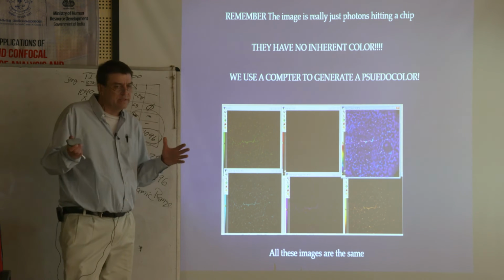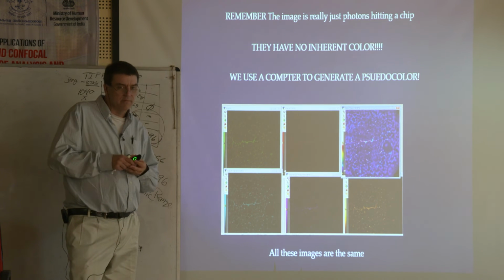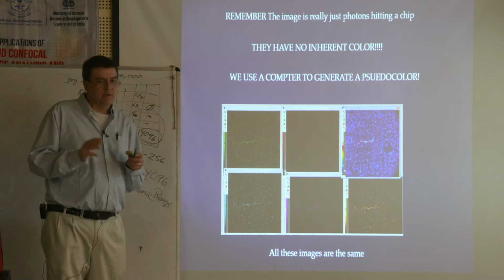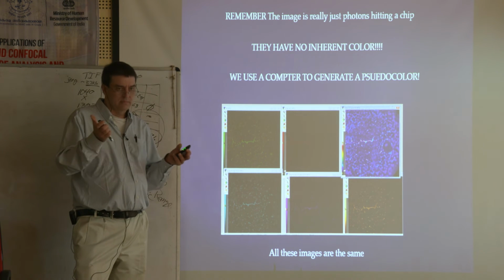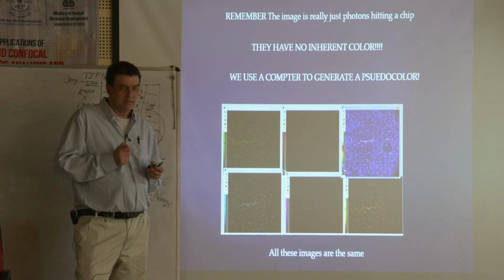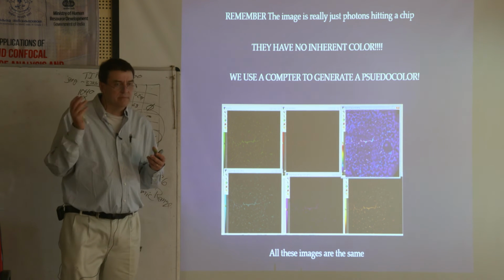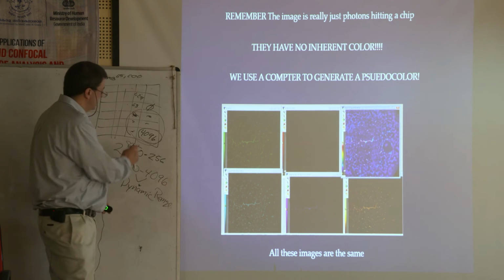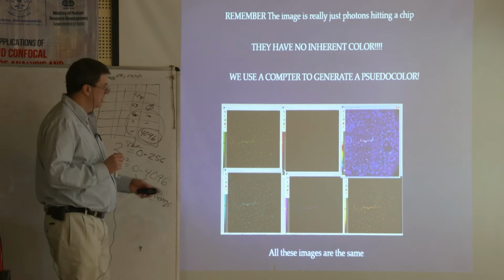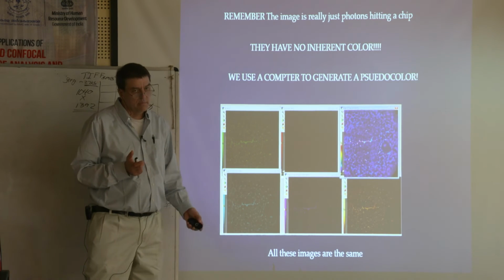Is everybody clear on this concept? Because this is a key concept to the whole idea of how these things work. If you're not clear on it, let me try to explain it a little better. We good? What do you think? Because it's not an easy concept to wrap your head around sometimes. But again, it's not really colors, it's math. The brighter, the higher the number; the darker, the lower the number.